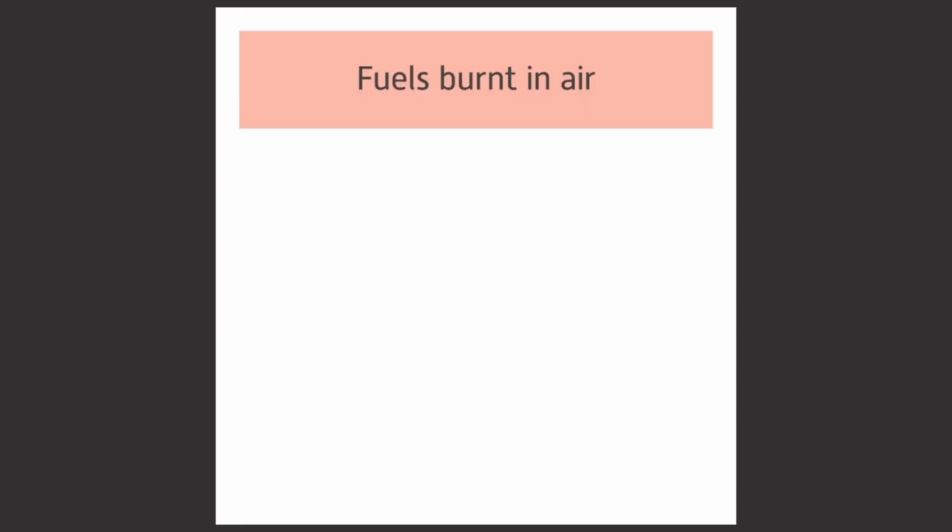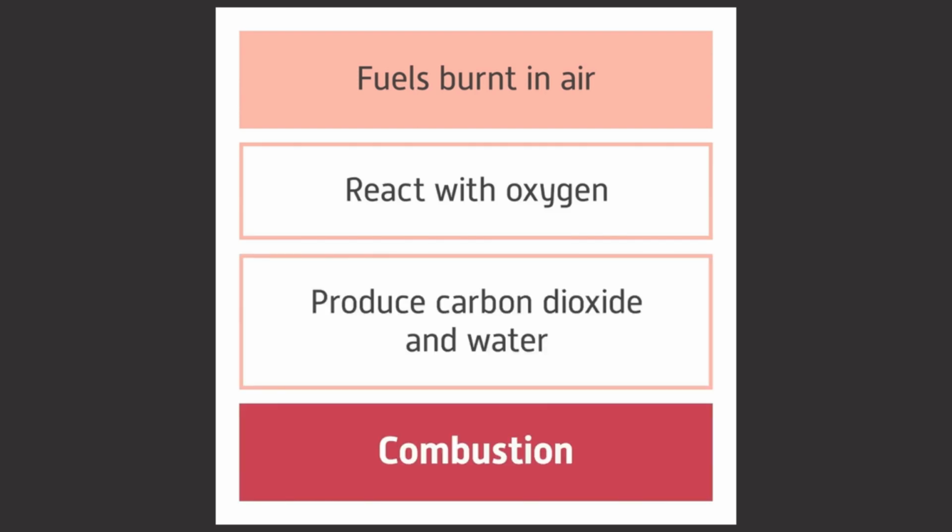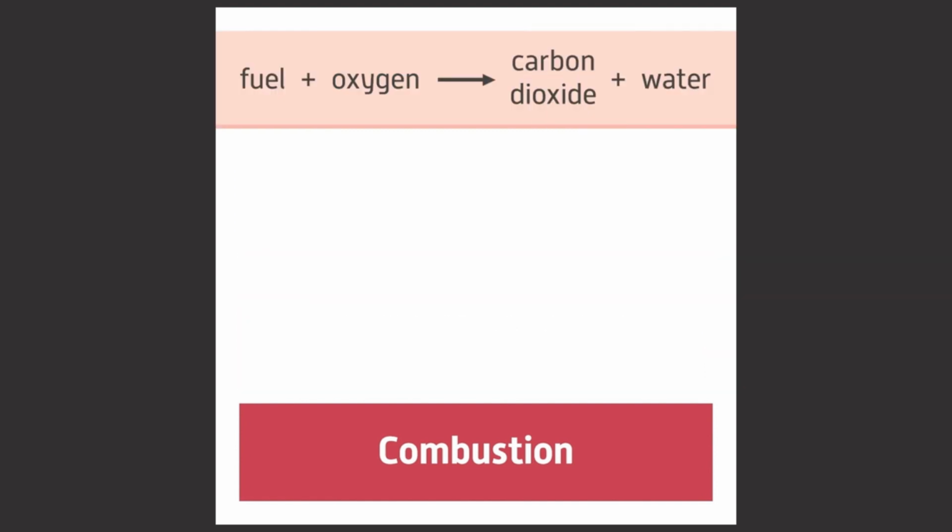When fuels are burnt in air, they react with oxygen to produce carbon dioxide and water. This chemical reaction is called combustion. The equation is fuel plus oxygen gives carbon dioxide and water.